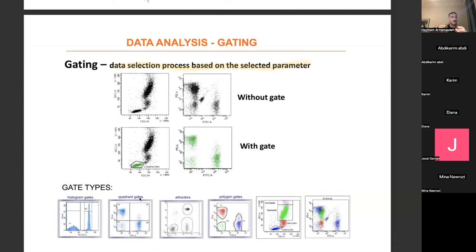I expose all of the cells to our flow cytometry. And the flow cytometry separates them according to the antigens on their surface. And all of them are black, so we don't know what cells are where in this graph. Where are my B cells, let's say, for example?